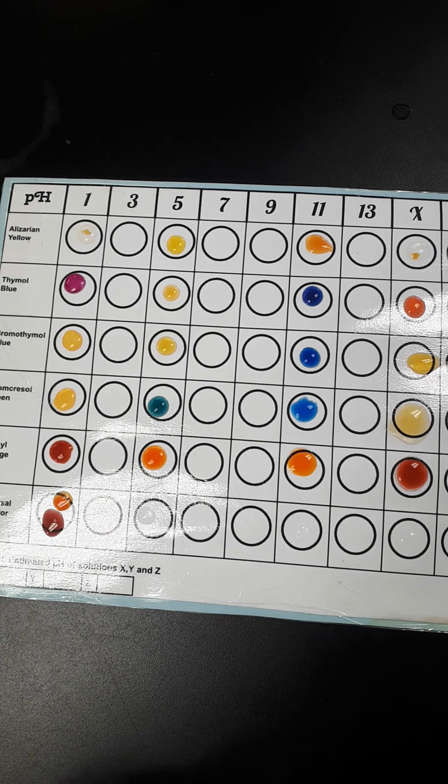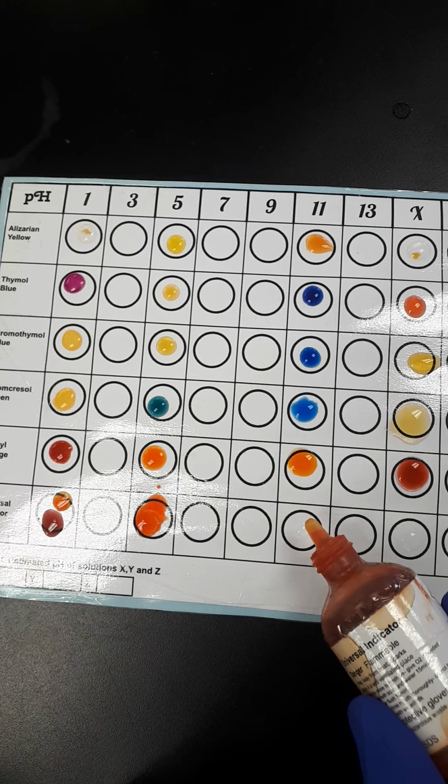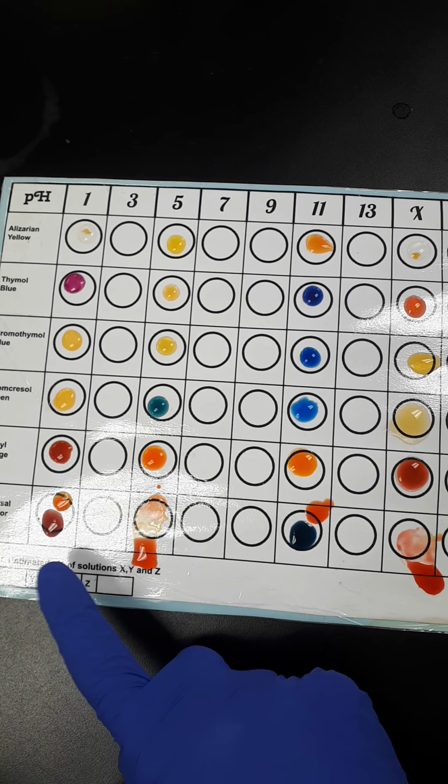And then finally, the last one's just to show us with the universal indicator how it can be many, many different colors. So universal indicator with a pH of 5, universal indicator with a pH of 11, and then with our unknown, my guess is it's going to look pretty close. Oh, there it goes, dripping off. Pretty close to that original one.